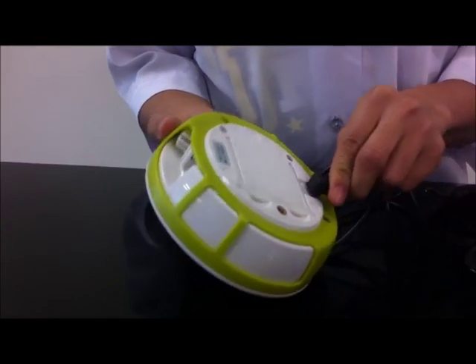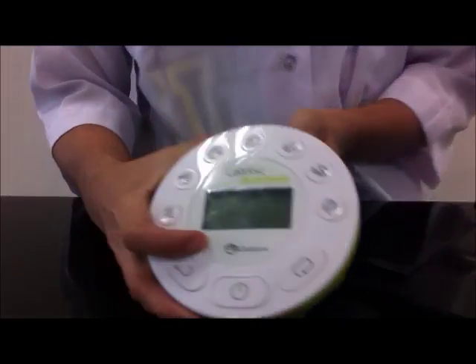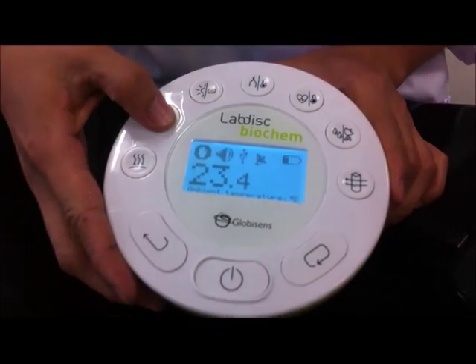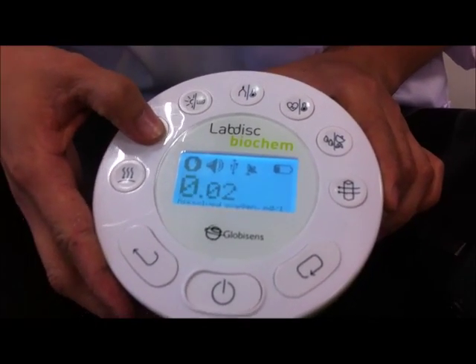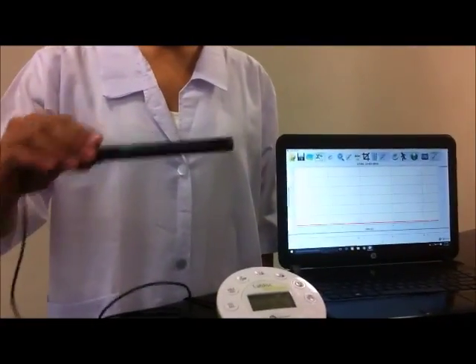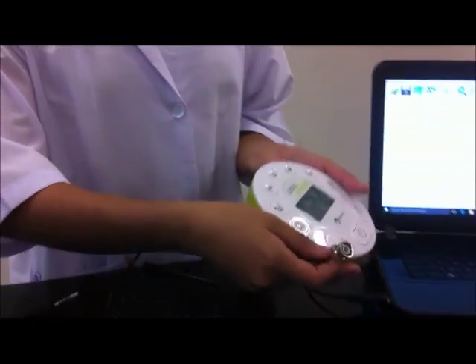Now the GlobalLab helps us to know the exact measurement of conductivity, making our work on this experiment easier. Next, turn it on and then set the GlobalLab. With care, we have to connect the electrode to the lab disk.